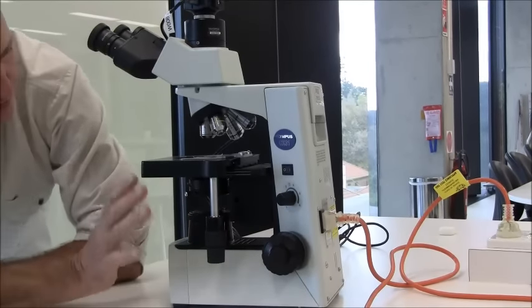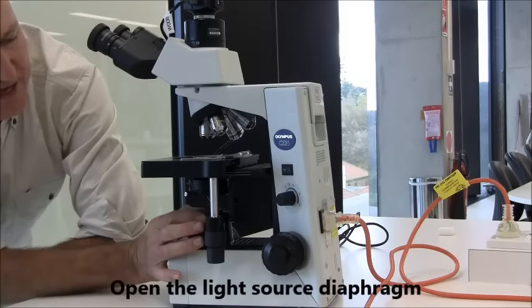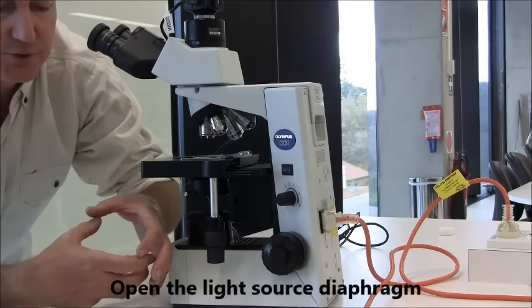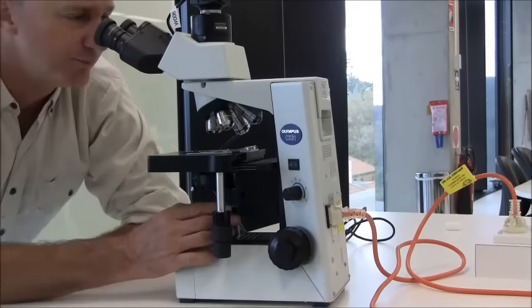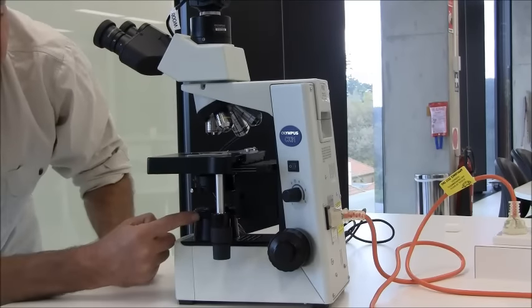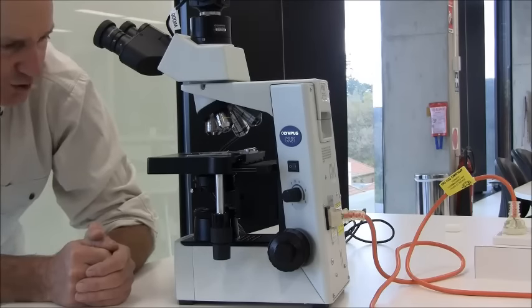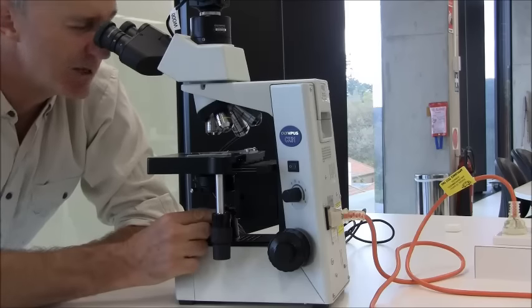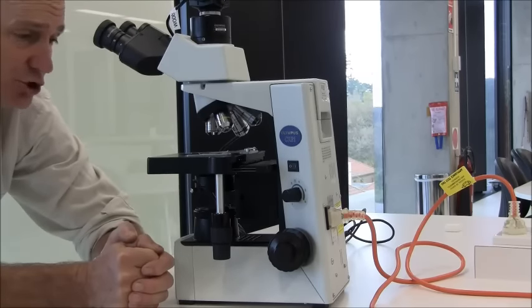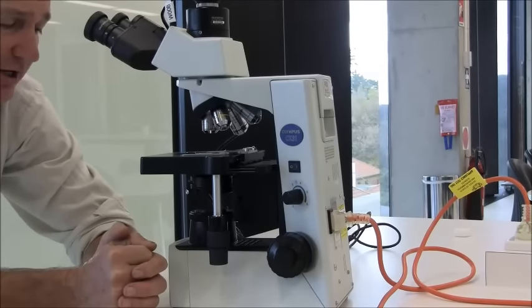And then once that shadow image is sharp, you open up that diaphragm until the light increases, until it fills the field of view. Now, this is a mistake a lot of students often make. They leave that iris diaphragm from the light source shut, and it's a wonder you can see anything at all. So that has to be reopened. And now we focus the condenser. It's something that you should do every time you get a microscope out from the bench and set it up for the first time.